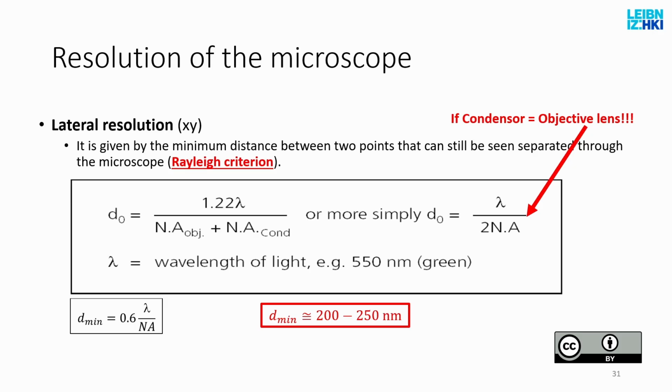On the other hand, if you say, again, my example, I want to just count nuclei. They are, I don't know, 2 micrometers in diameter. Then you don't need the best microscope and the best lens because you need a resolution of, I don't know, 500, 600, 700 nanometers to see them. So you adjust your experimental conditions and your microscope selection based on what you want to observe.